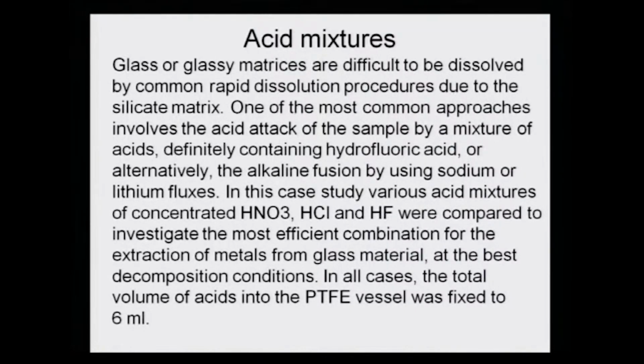In all cases, the total volume of acid in these Teflon PTFE vessels was fixed to 6 ml. It cannot exceed 6 ml because, although the vessels are slightly big, there has to be a vacuum space to be able to handle the pressures of the gases generated from these acids. They are not all in liquid form, some of them are also in vapor form, and if the liquid volume becomes large, then the total space left will be small. So, it was kept in mind that these three acids, the hydrochloric acid, the nitric acid and the hydrofluoric acid, must be taken in combination for the glass decomposition, and the total volume of these three concentrated acids should not exceed 6 ml.